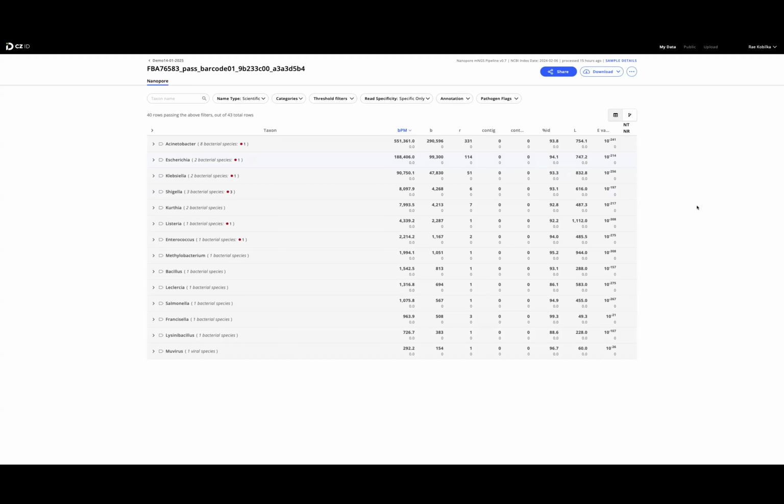That's a really good question. It always depends on the way you analyze it. You have to be sure that the data is really correct, or the results are correct. So at this point, it is not so clear to say. Maybe you've got a sample with both species inside of your sample, because you always have to keep in mind all of those different categories.